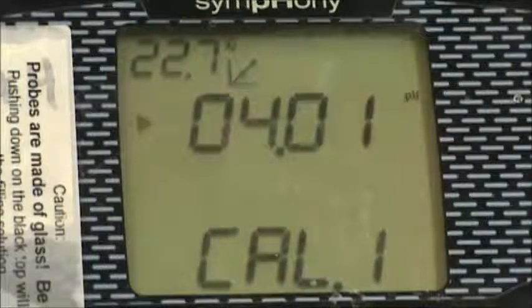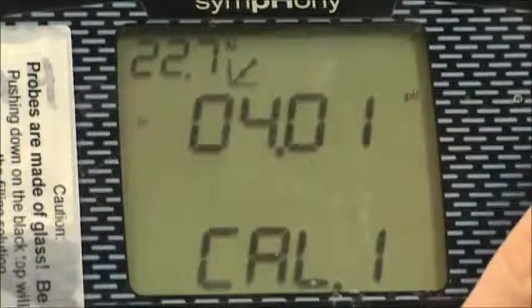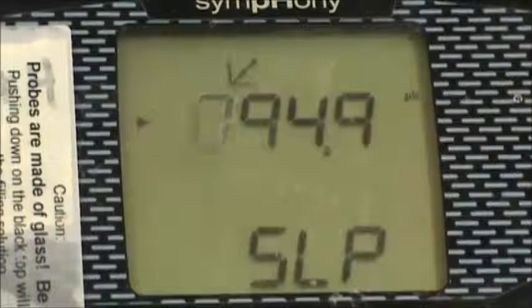You will know that the reading is stabilized when the pH icon on the right side of the screen stops flashing. Press measure to save the value for the calibration.